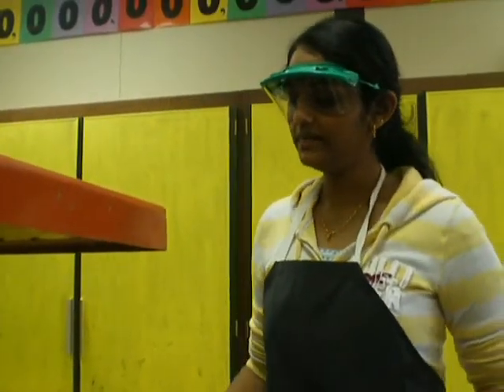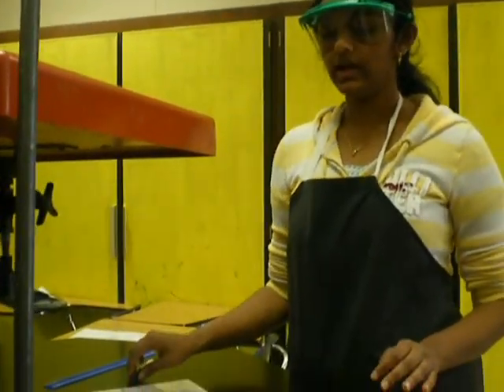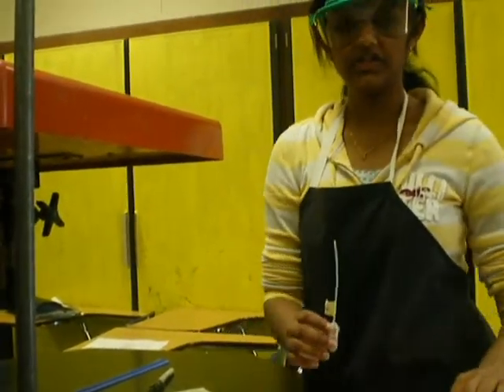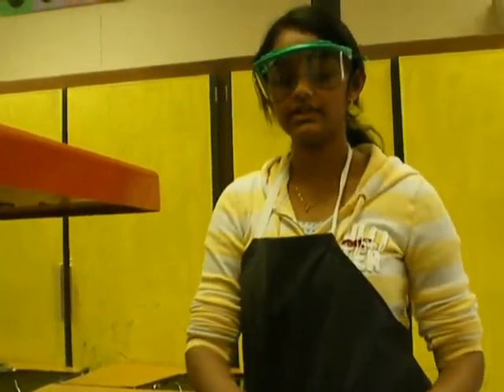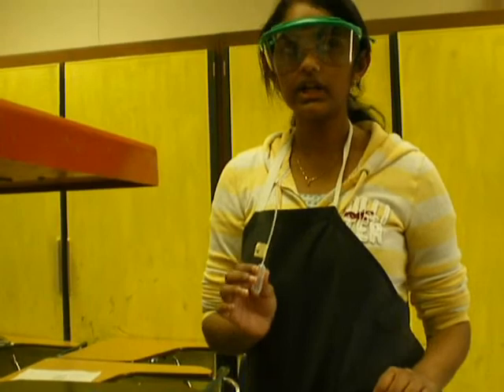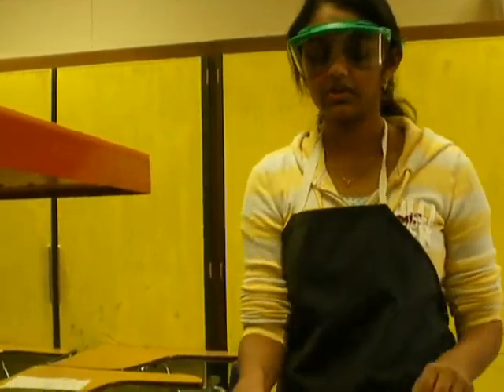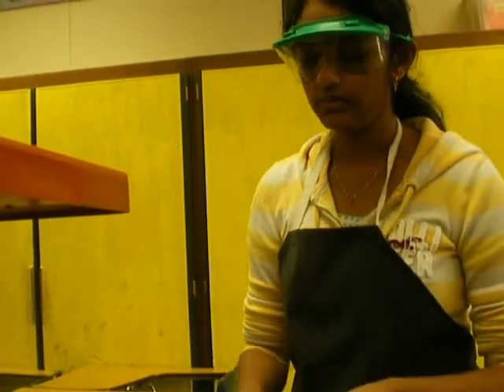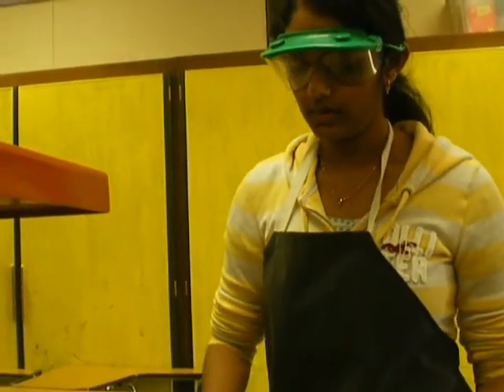Okay, so to do this lab, we're going to be mixing different compounds. First, fill each of your pipettes with a sample from each of the different compounds. Make sure that when you're doing that, you're not contaminating any of the pipettes, because then the reactions won't occur the way they're supposed to. And they're toxic, so be careful.